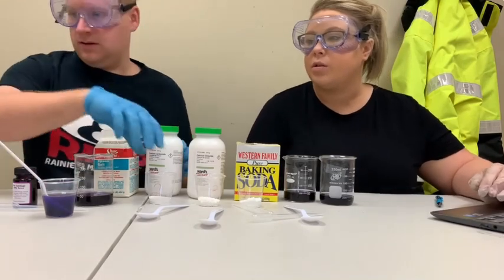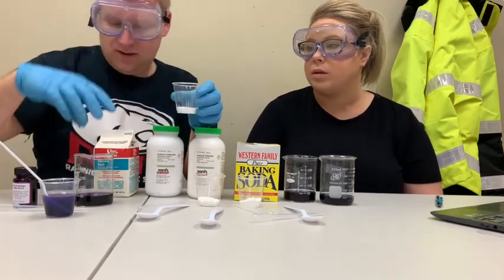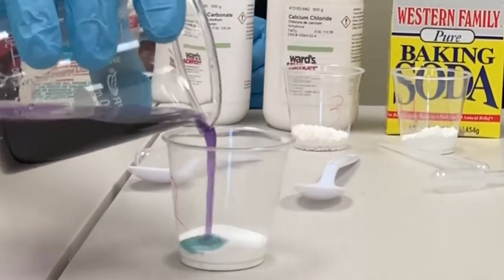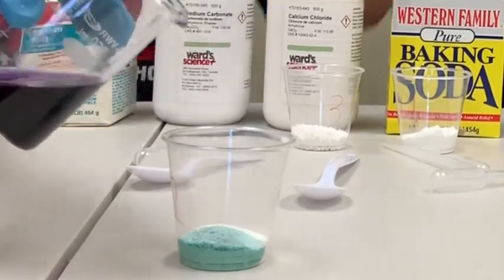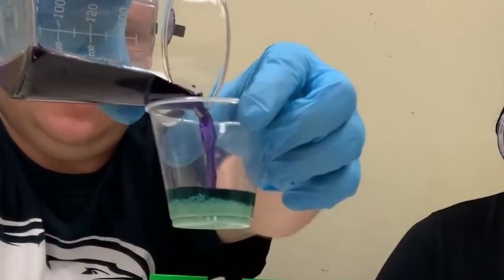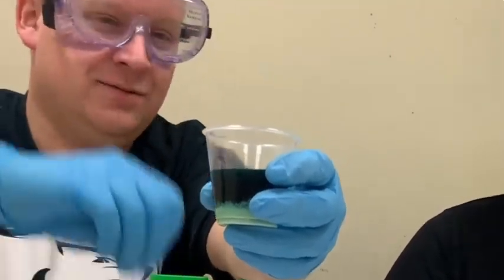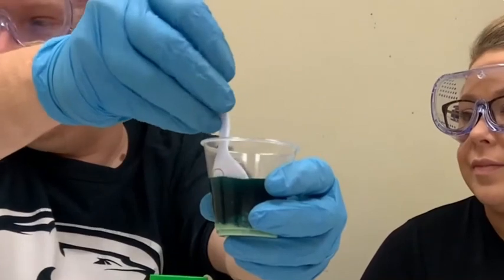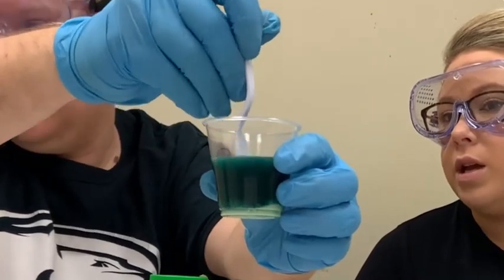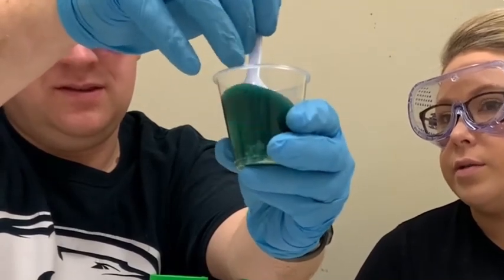So the next one is the sodium carbonate and the cabbage juice. So we have our sodium carbonate. Here's our cabbage juice. We'll put it up here so we can see. Well, that's a very strong color change. That one is a very dramatic color change. It goes to this bluish greenish color. And then we stir that one. Oh, this was nice. It's nice and warm. So we definitely had a color change. So far it's turning more like green, like a teal color. And as it dissolves more, we'll see how it changes even further.